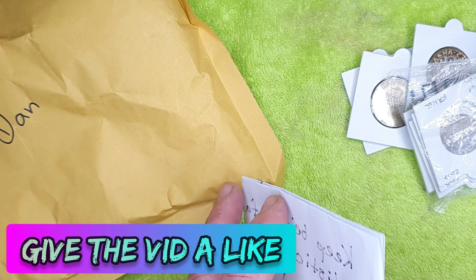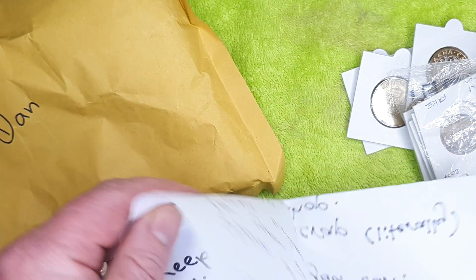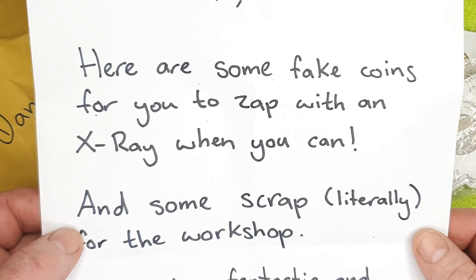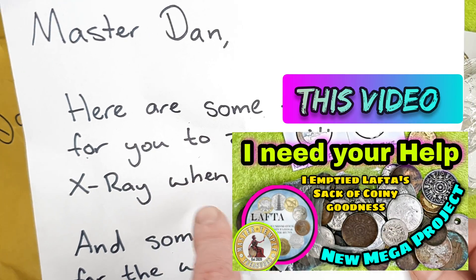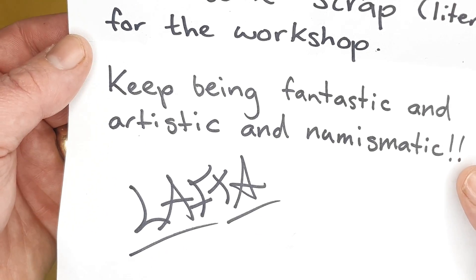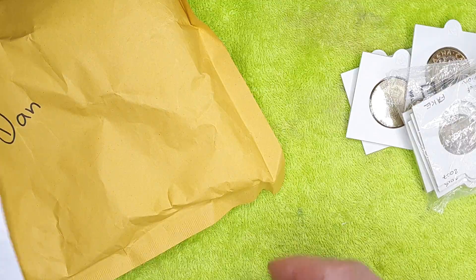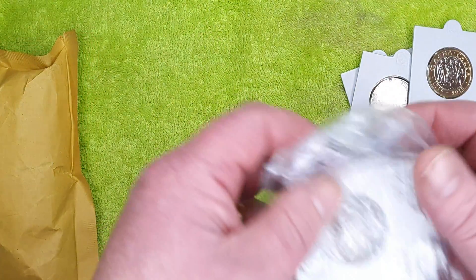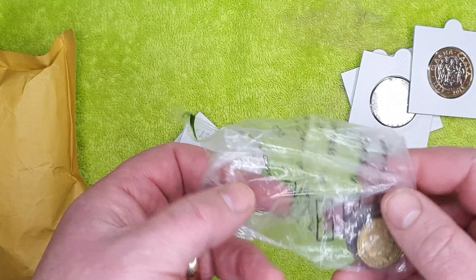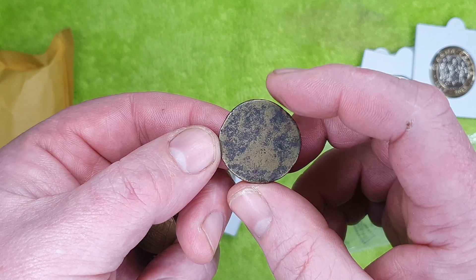Hopefully it'll be done soon. Also in this package was a letter — we've read this before on the Royal Mint trip video — and it says: 'Here are some fake coins for you to zap with your X-ray gun when you can.' There's Luther's very iconic signature there. I've got the X-ray gun again, so let's have a look. I've taken them out of the packaging because I've actually already zapped them, so I know what these are made out of now.